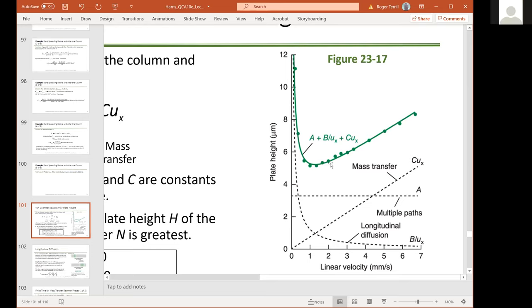It increases. Yes. It gets ridiculous, right? Because we're already at like 250 times atmospheric pressure. And if you want to pump twice as fast, your pressure is going to go up to more than 500, I guarantee it. So that is why we are always on this side of the curve on HPLC. So right now, what we really need is the world's greatest plumber.